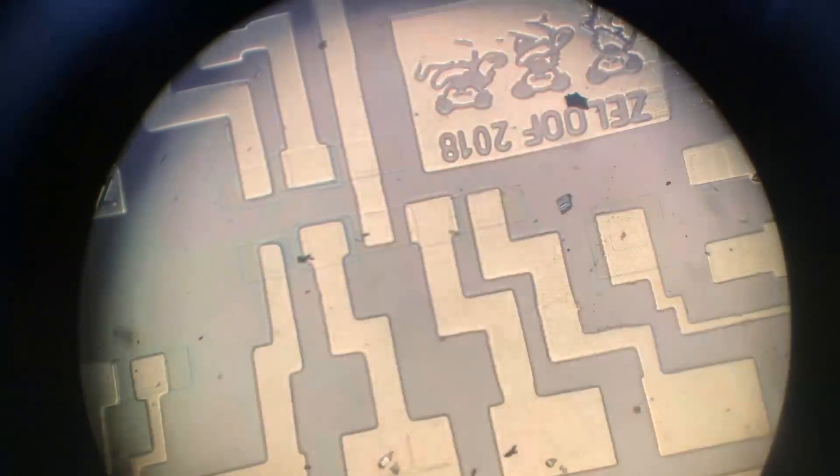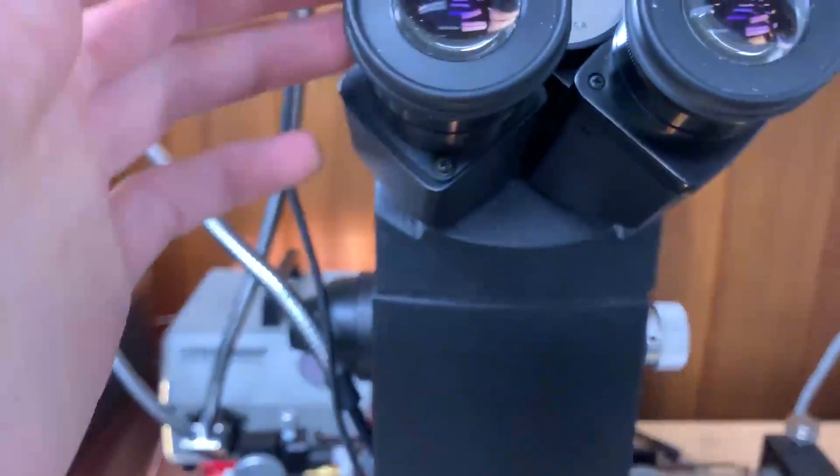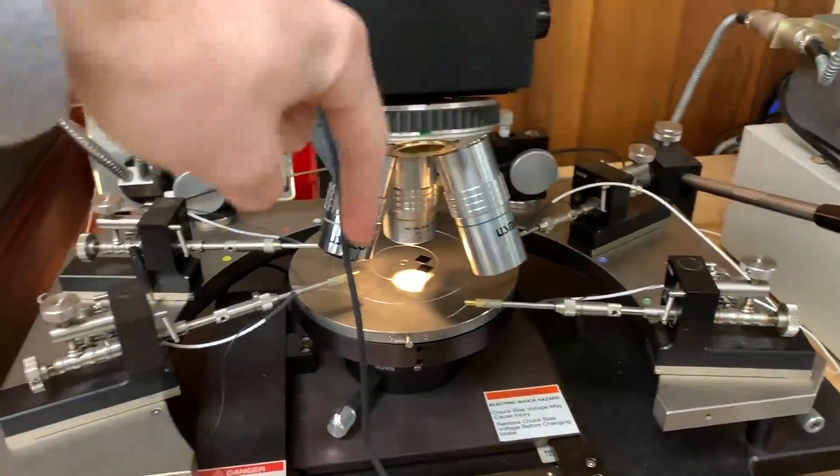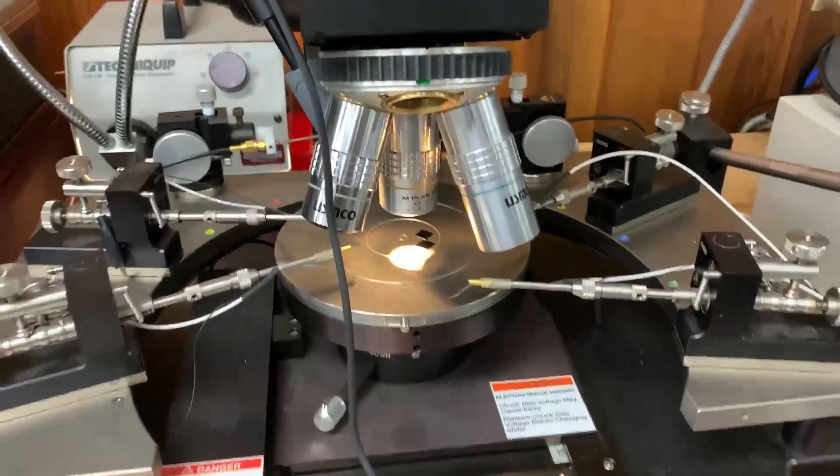Having the eyepiece on this microscope setup is nice for alignment. I can get like this focus spot and I can measure the thickness of the film anywhere on it which is pretty nice.